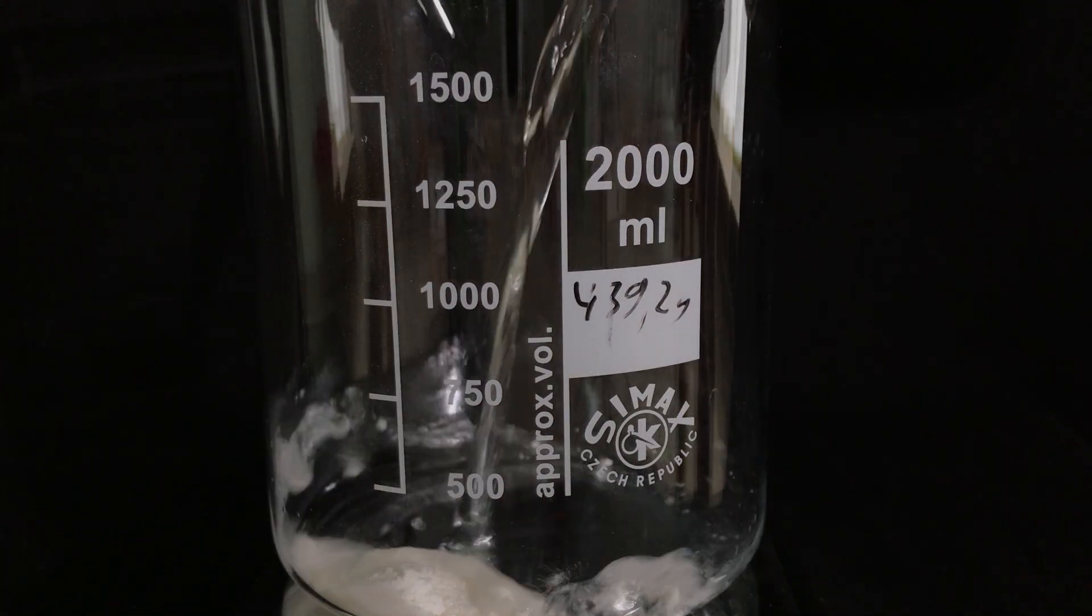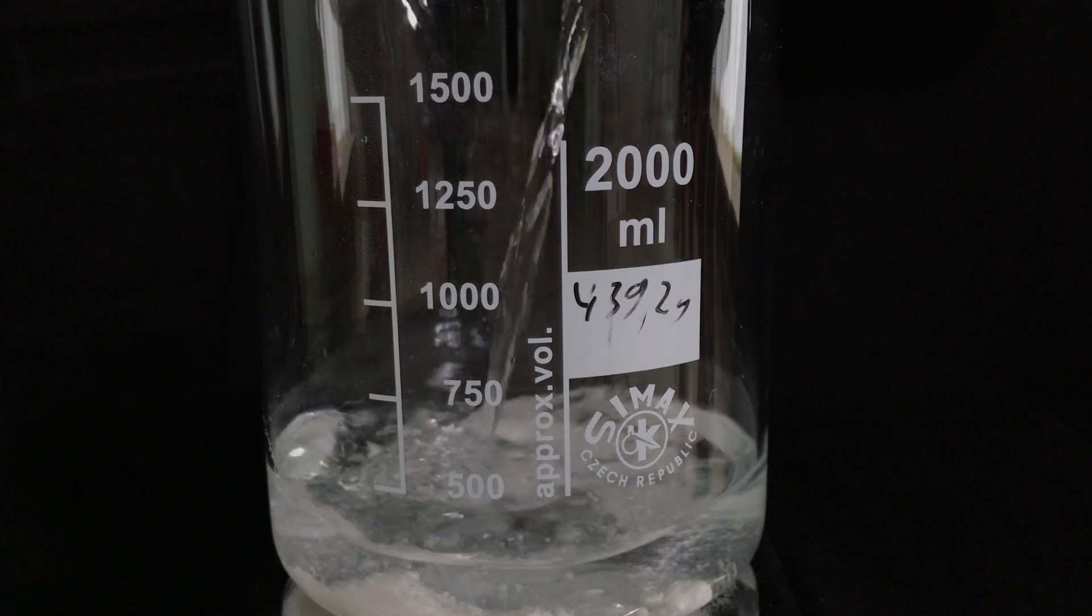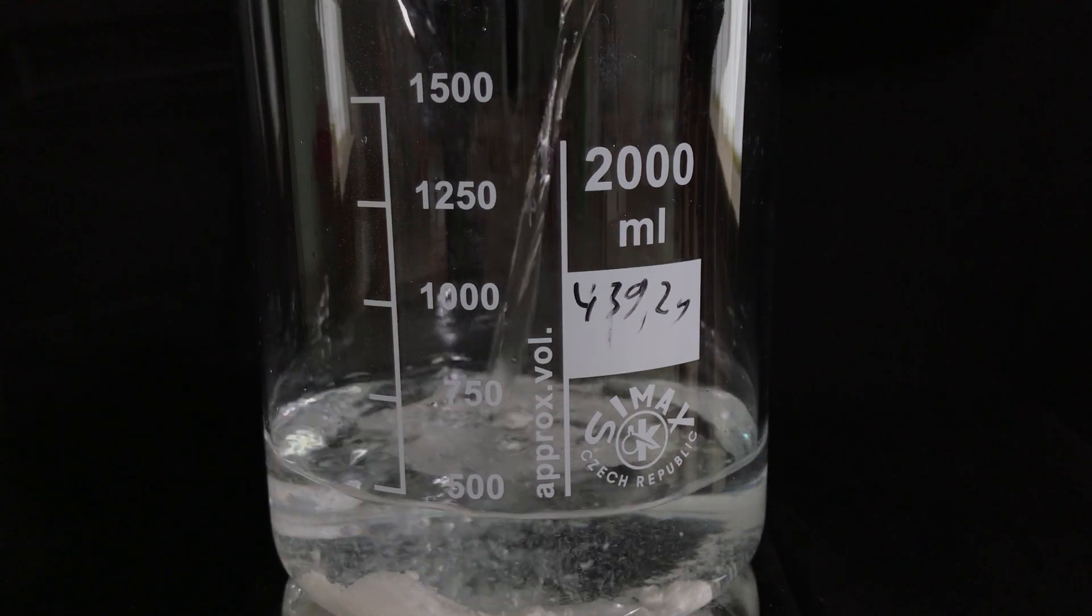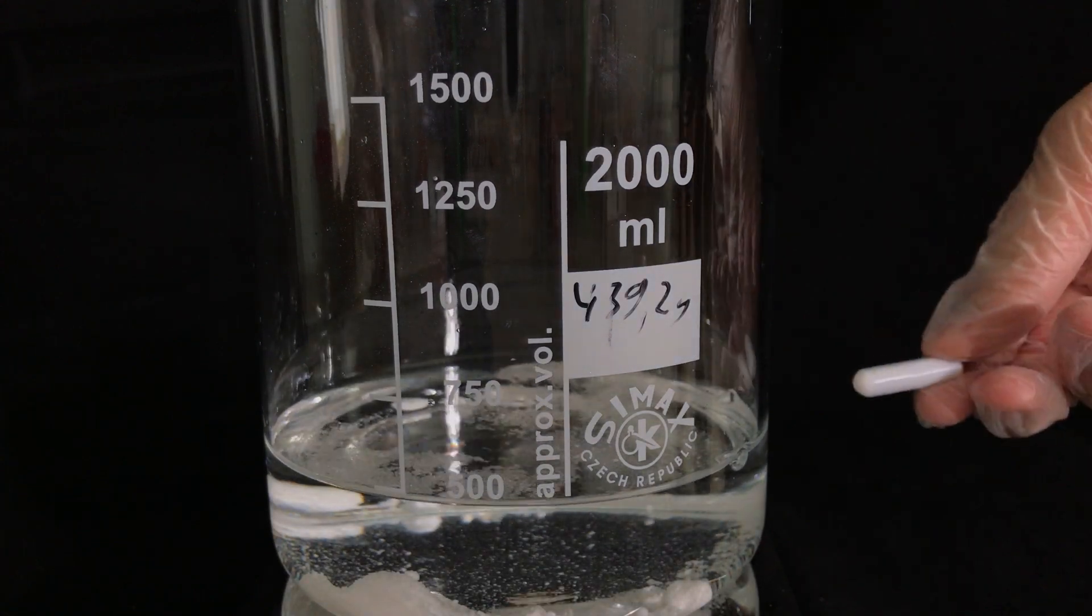Now that the mercuric chloride is in the beaker, we need to dissolve it. Therefore, distilled water was added. The final product would be poorly soluble anyways, therefore you can't overshoot by adding more distilled water. To speed up the dissolving process, we added the stir bar for stirring.